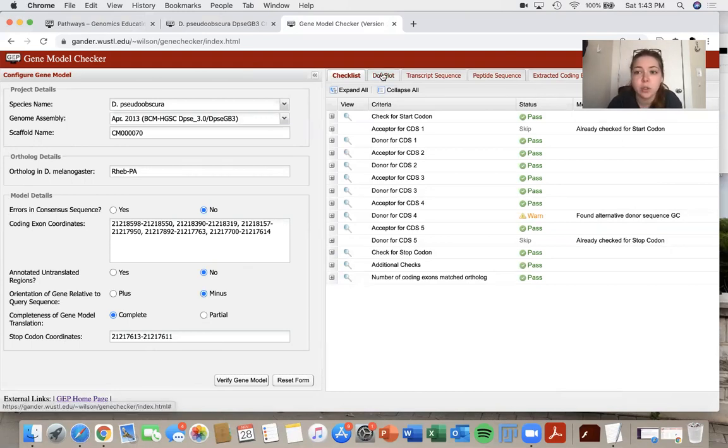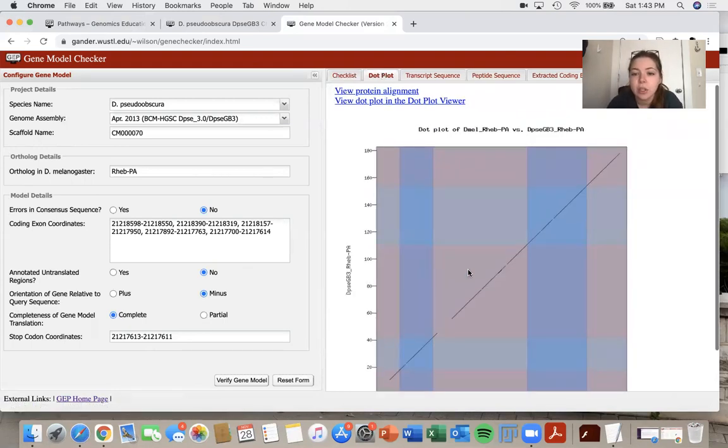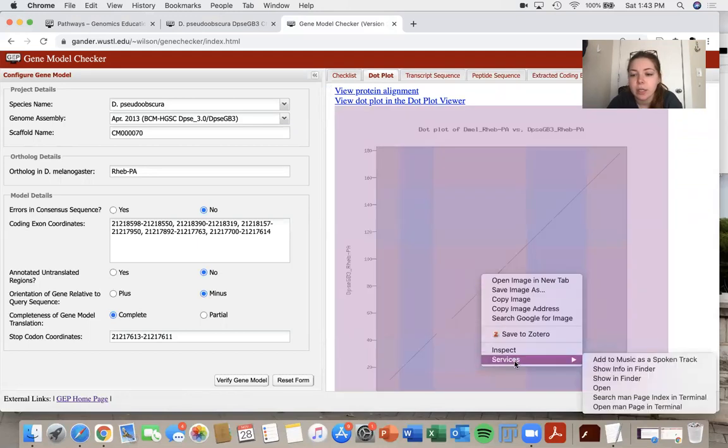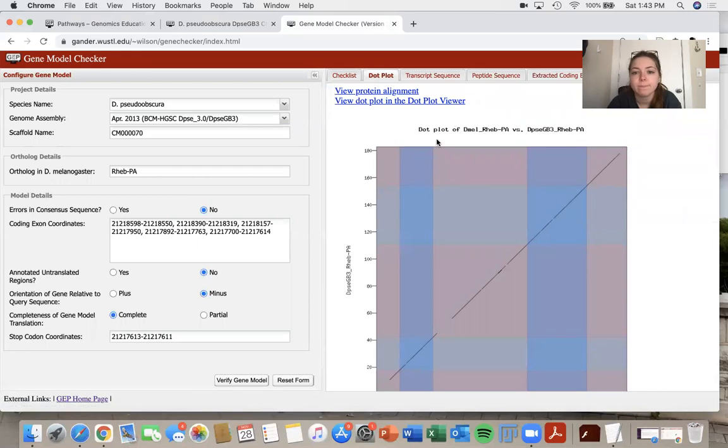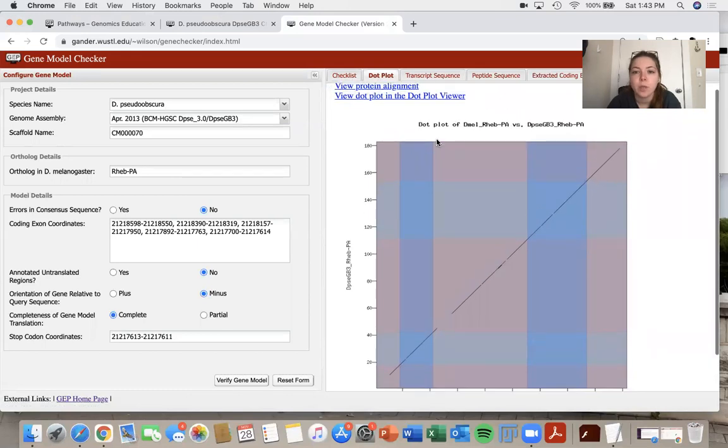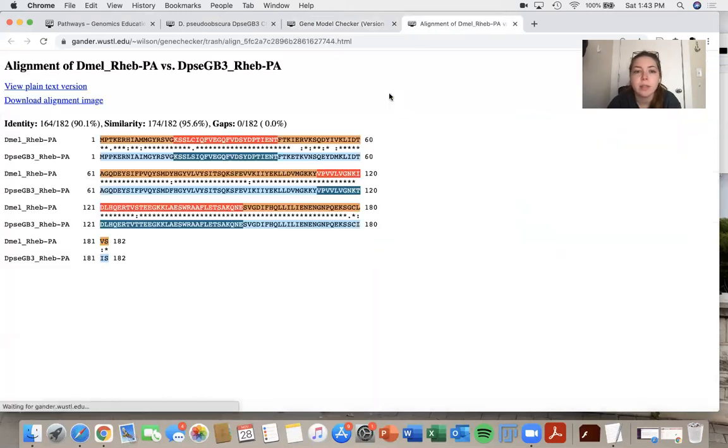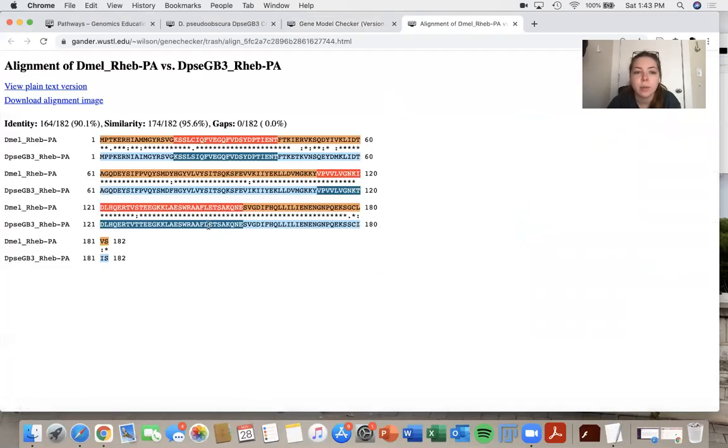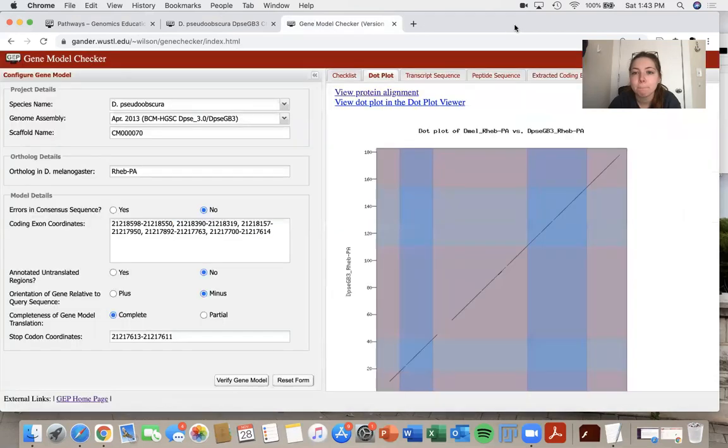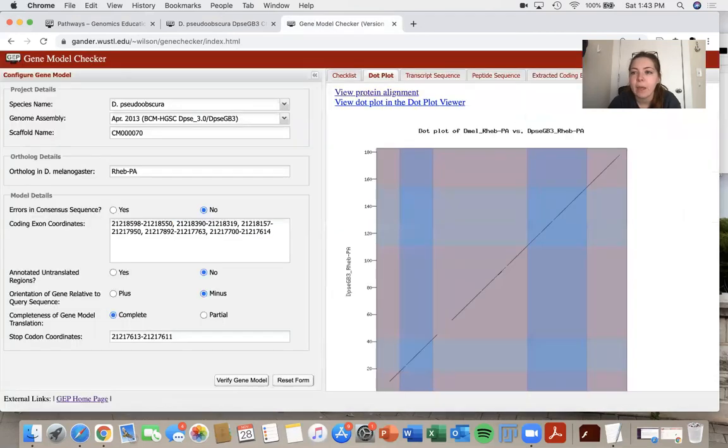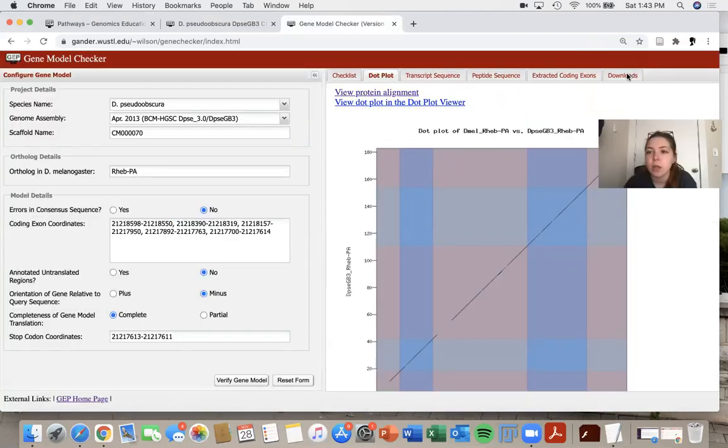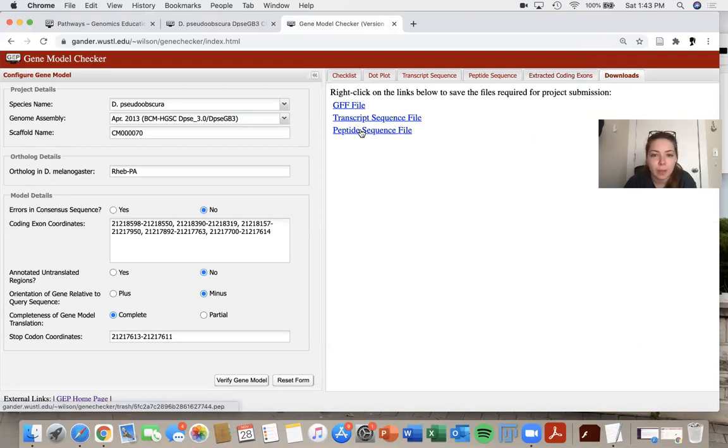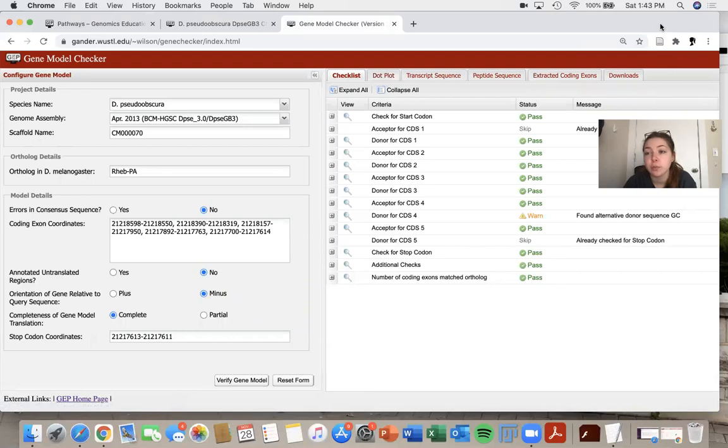Then we also want to get the dot plot and you can just right click and save your image. And then we also would like to get the protein alignment. So you can come here and get your protein alignment again, right click, save your image. And then the last things that we want are, we want to download the GFF file, the transcript sequence file and the peptide file. And then those will also be included in your report.